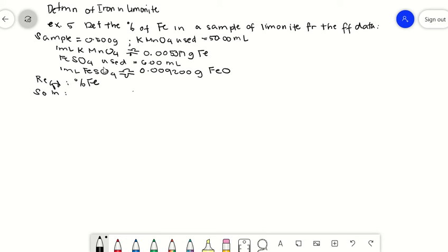However, you can see that there is another ferrous sulfate used here. If you're going to write it, the mole equivalence of iron is equal to the mole equivalence of potassium permanganate, iron being the reducing agent and potassium permanganate being the oxidizing agent. But there is, again, iron here, which is ferrous sulfate, a reducing agent. This is now in excess, used for back titration. It was overstepped, so there is now a volume used for back titration.